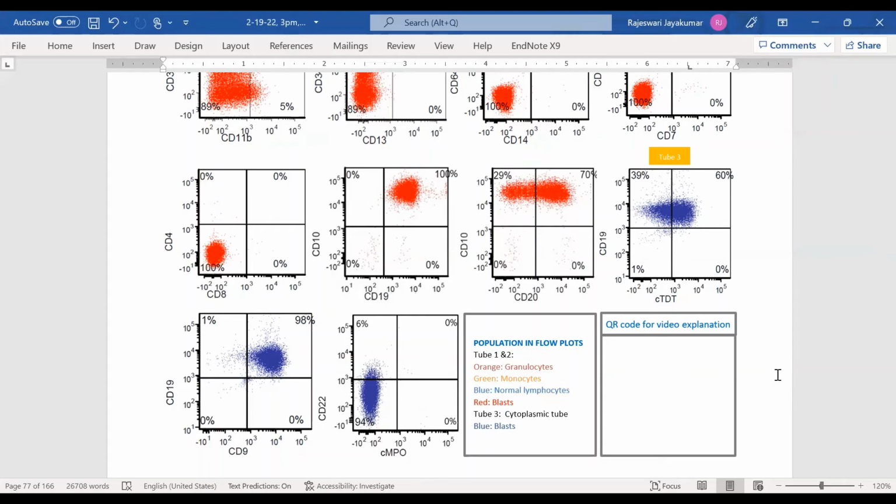Some clinical trials also require the percentage of blasts expressing CD20. They say that they can use rituximab for some cases of relapsed refractory B-ALLs if more than 20% of blasts express CD20. So the percentages are important for CD20 and CD22.